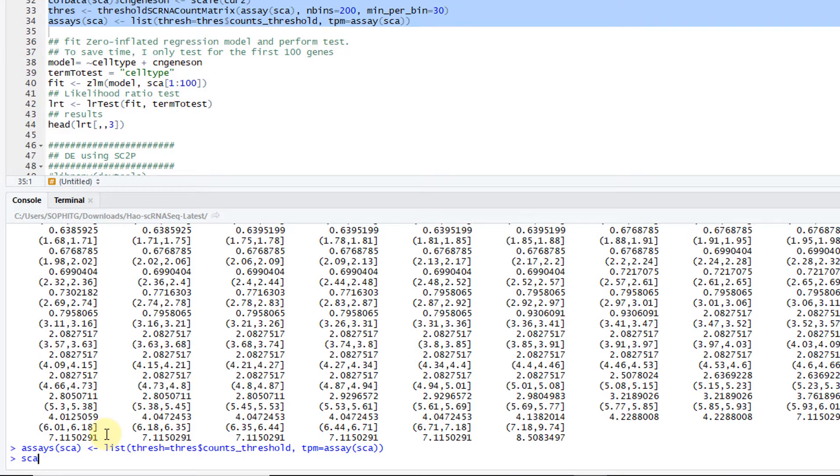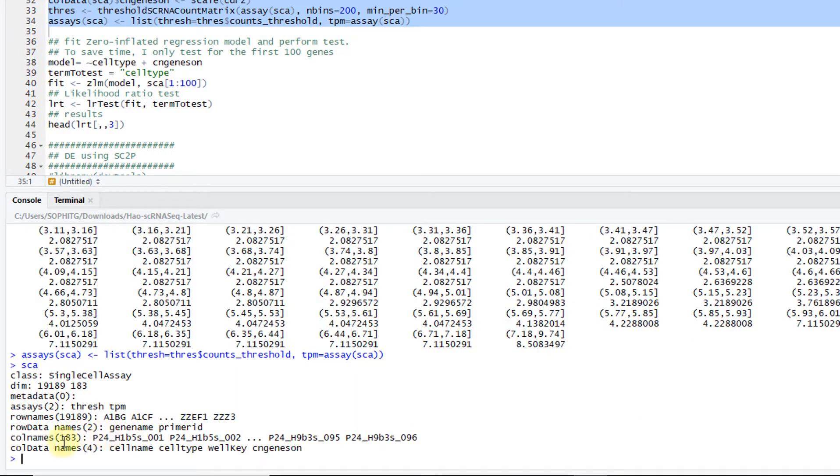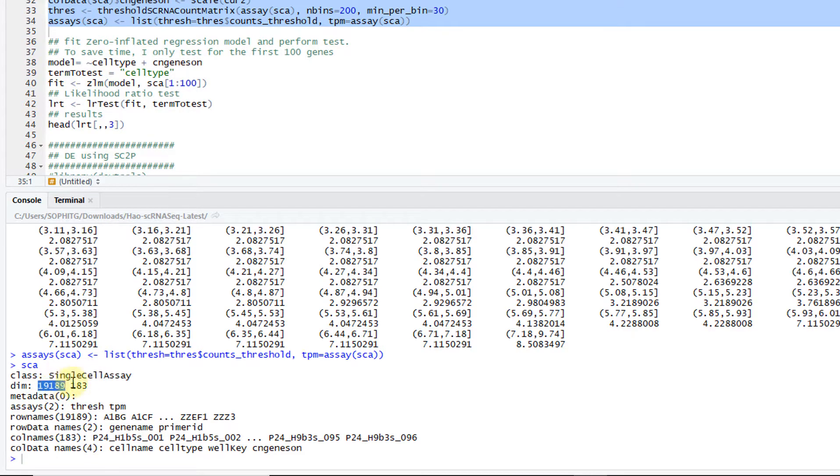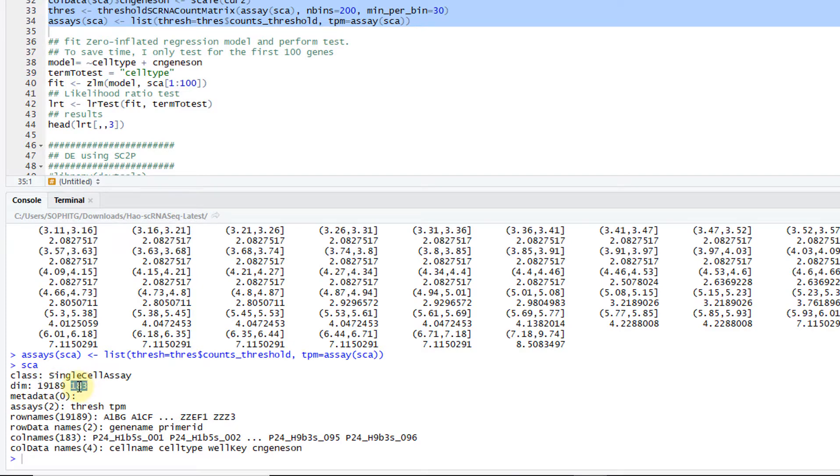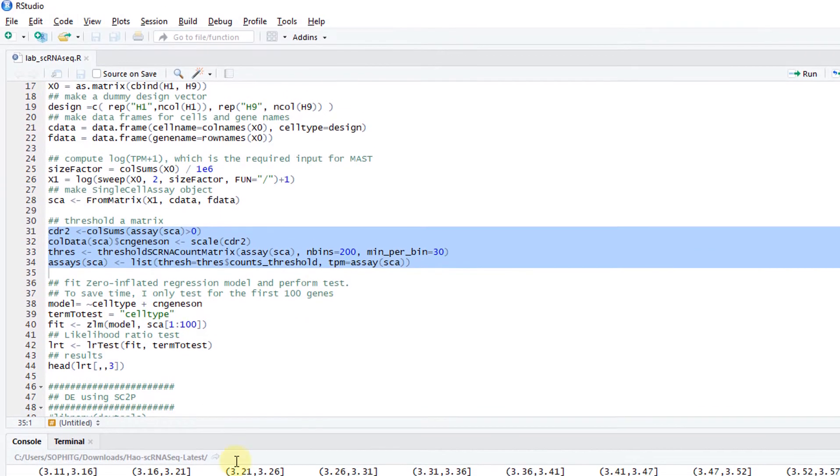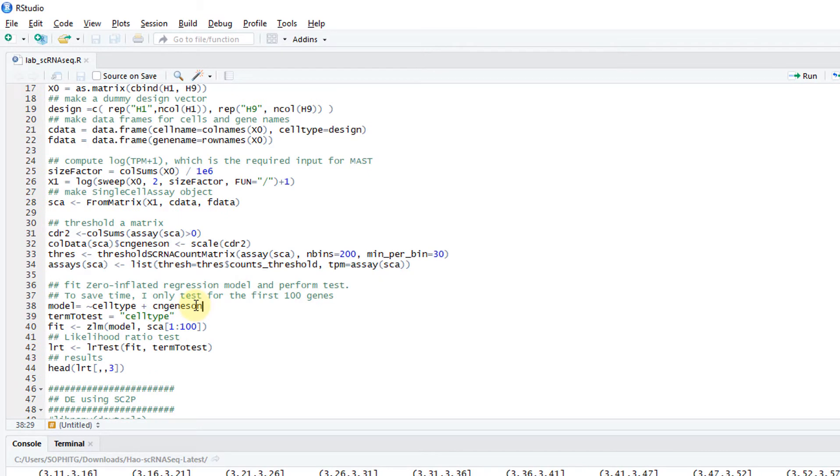Now I have my SCA ready. SCA is the object, a single cell assay. Here's the dimension. Basically 19,000 genes, 183 cells. Then just some other information.